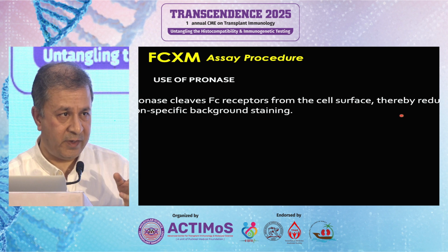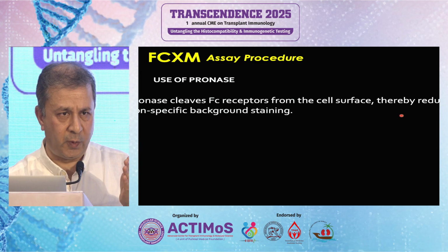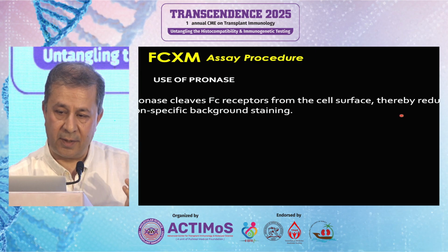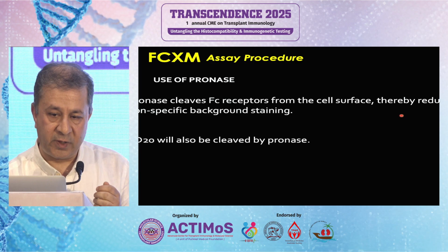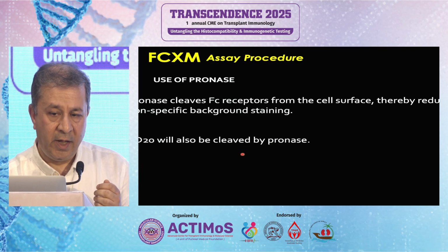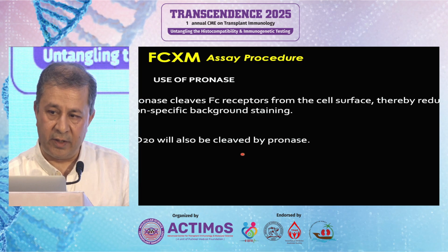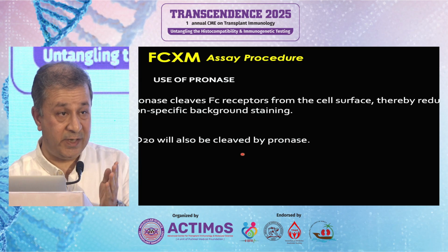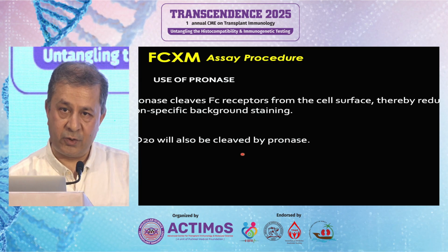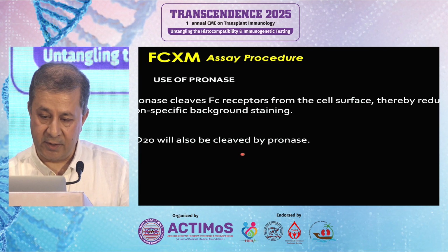All right, the other part of it is pronase. Somebody was talking about it in the morning, do you use pronase on CDC? The usual concept is no, but sometimes people do use pronase. We use pronase upfront in our flow cytometry, and this also helps us in cleaving the CD20 molecule so that you have a rituximab effect, you can take care of it. But remember, when you do it for the cleavage of CD20, the concentration of pronase to be used is higher, and therefore standardizing it can become a potential challenge.